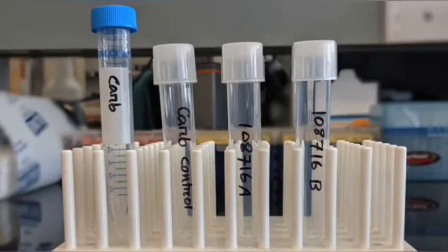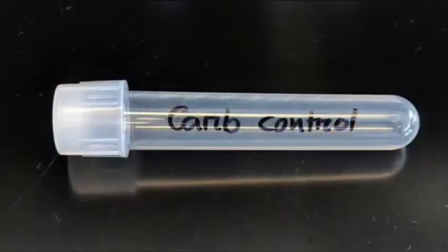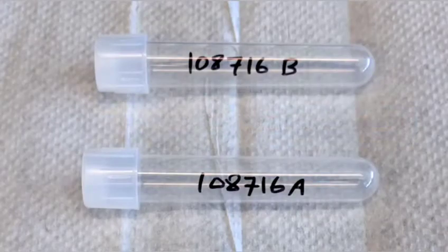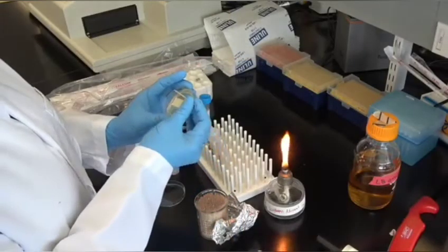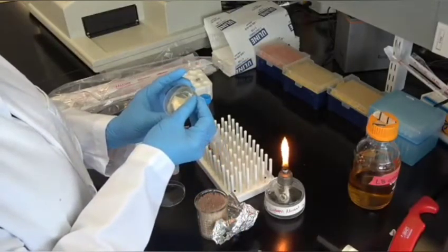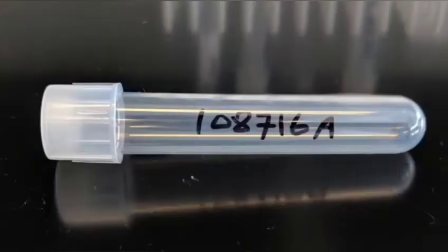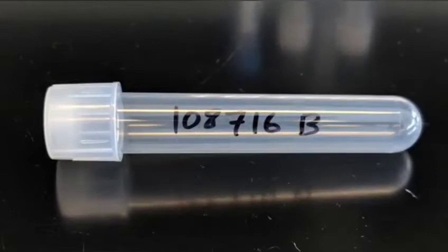Next, arrange three culture tubes in a rack. Label the first tube as a negative control, and label the other two tubes with the name of the plasmid. It's always a good idea to select more than one single colony for inoculations. To track these samples, we will label the tubes plasmid A and plasmid B, indicating the same plasmid but different colonies.